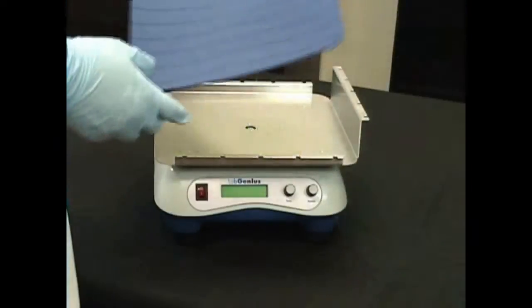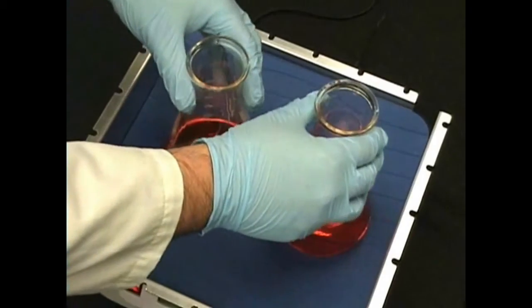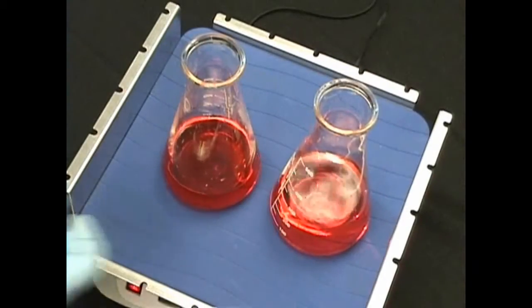Skid-free ribbed rubber mat acts as non-slip surface for petri dishes, culture bottles, media dishes, and flasks.